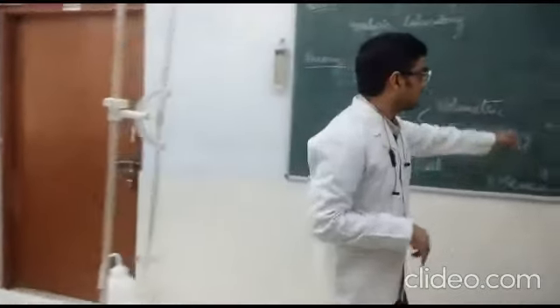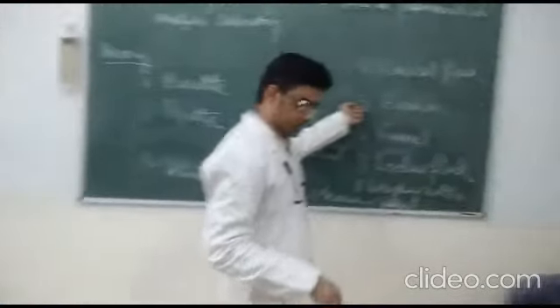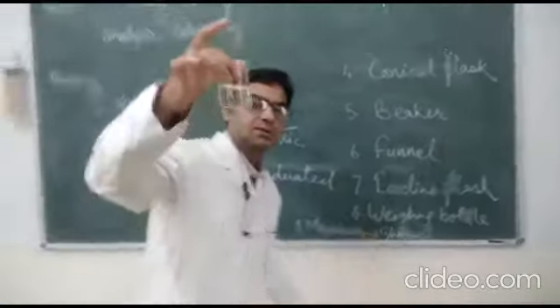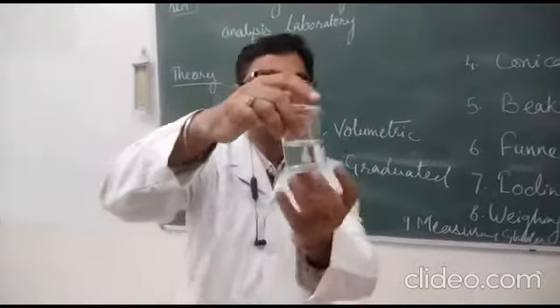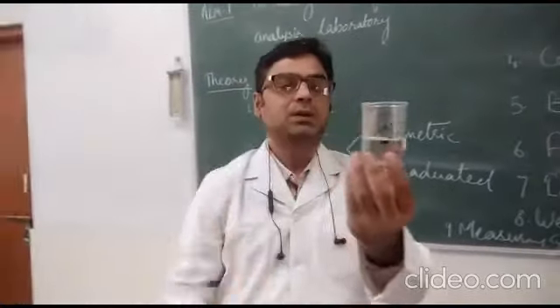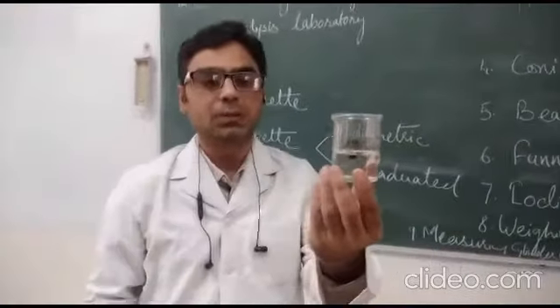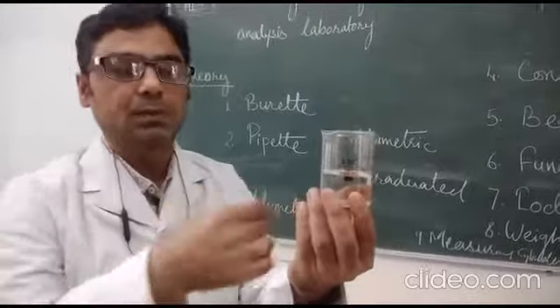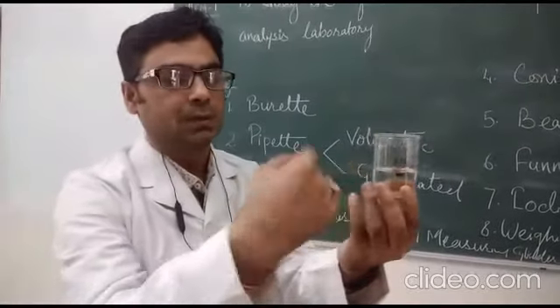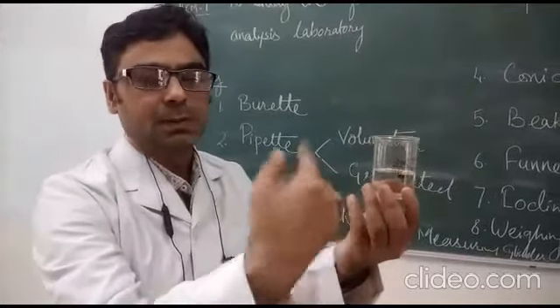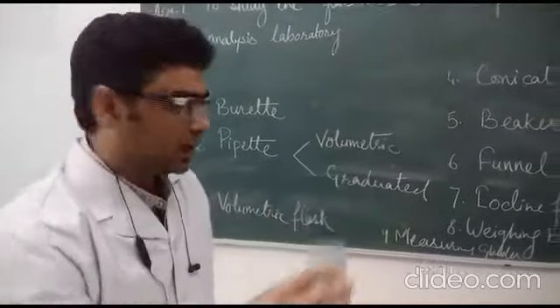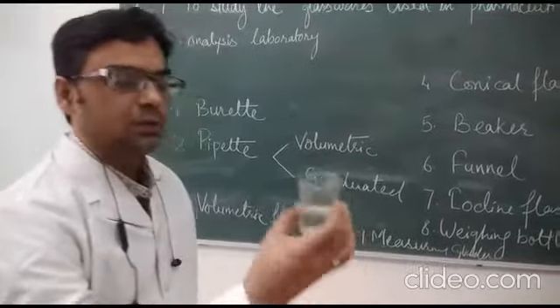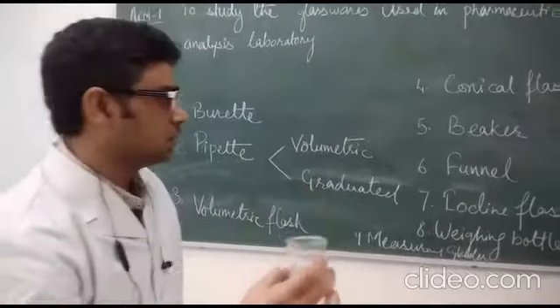Next is the beaker. You can see this beaker — one example is of 100 ml. Different volume beakers are available in the lab: 250 ml, 500 ml, and 1 litre. Various volumes of beakers are available and they are used to hold solutions.